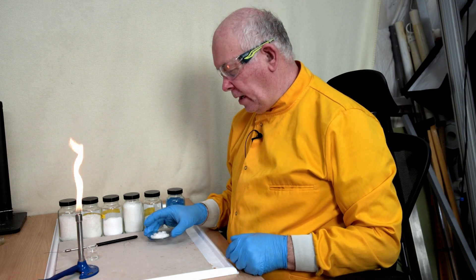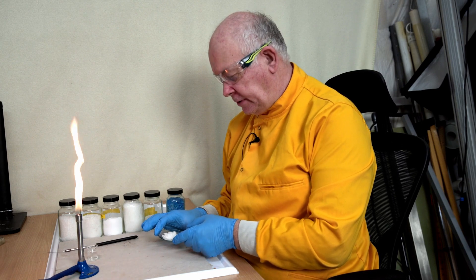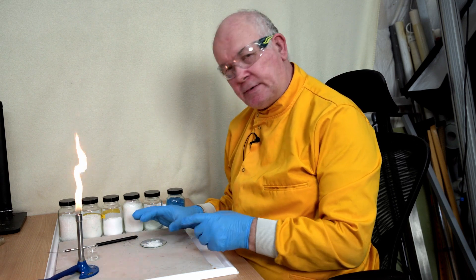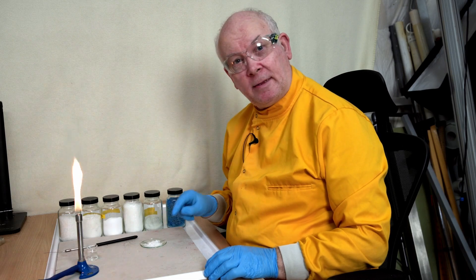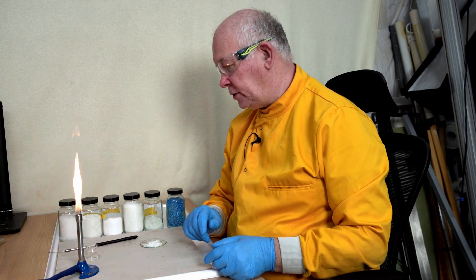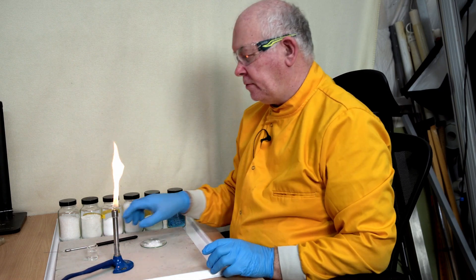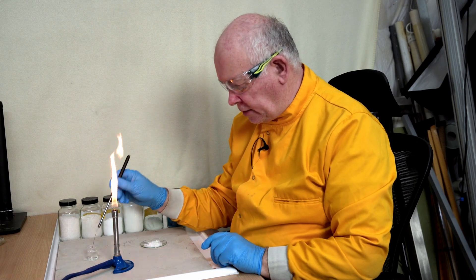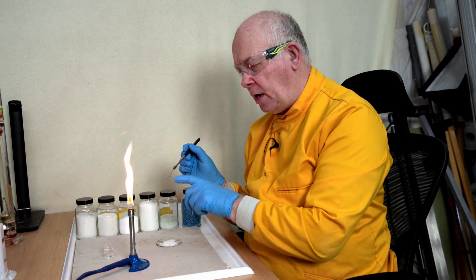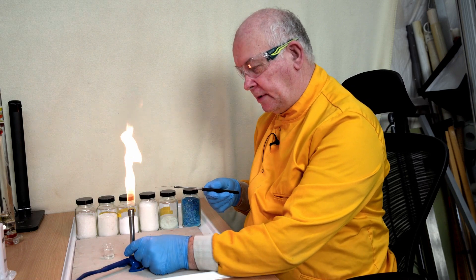I have a sample here of an unknown substance. I believe it's a salt, but I don't know which one. What I want to do is try and find out. One of the ways we can do this is to work out what the metal might be by doing some flame tests. We need a flame, so we'll put it on a roaring Bunsen flame to make it hot, and then I'm going to pick up a small sample on a piece of nichrome wire.